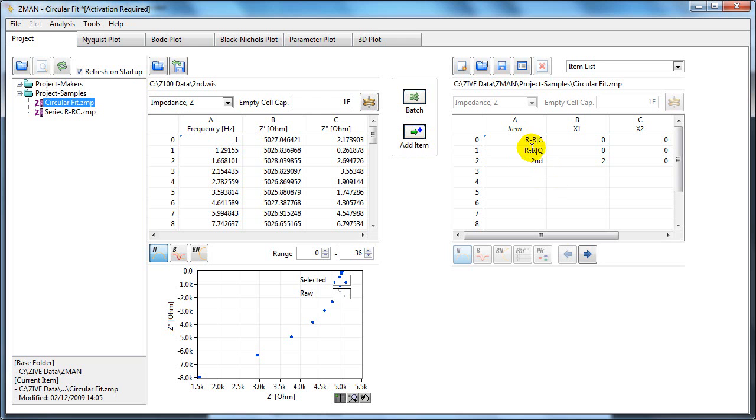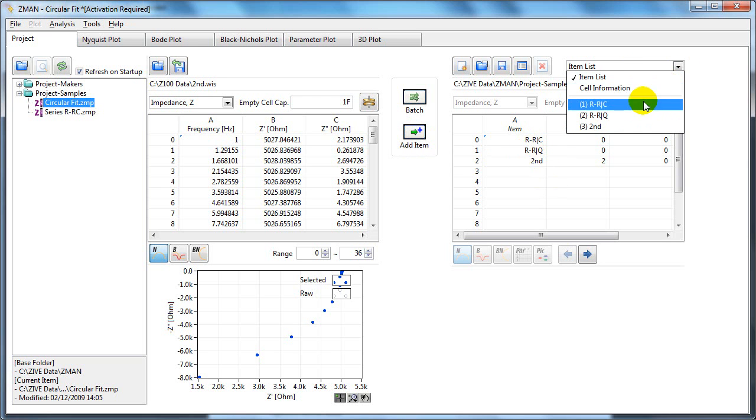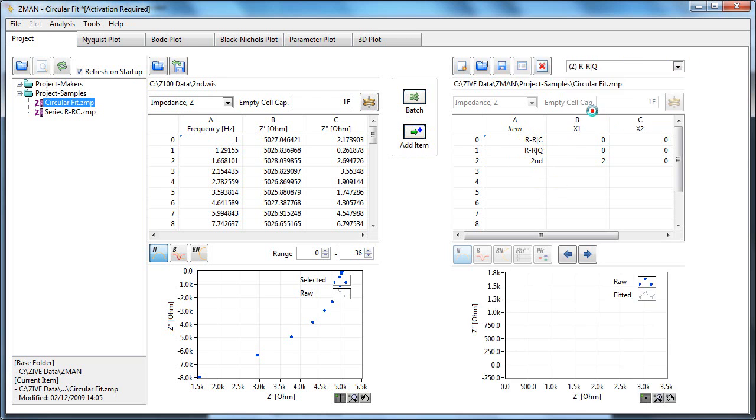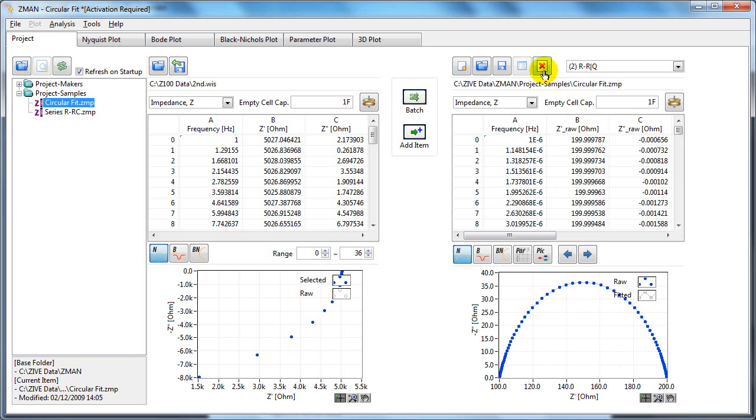We still have our two previous runs. If we want to delete those, we can select them here and delete them from here.